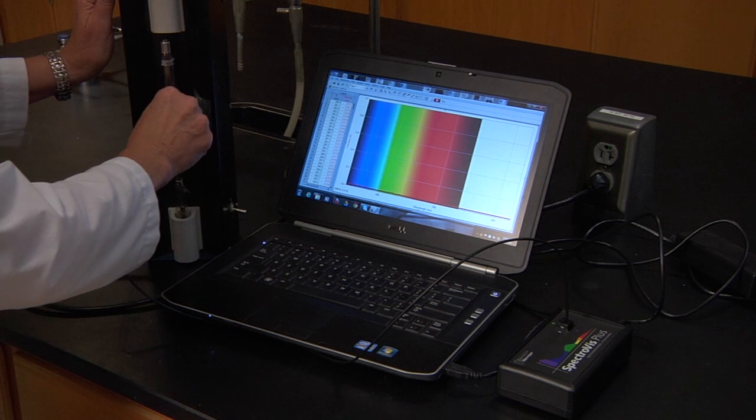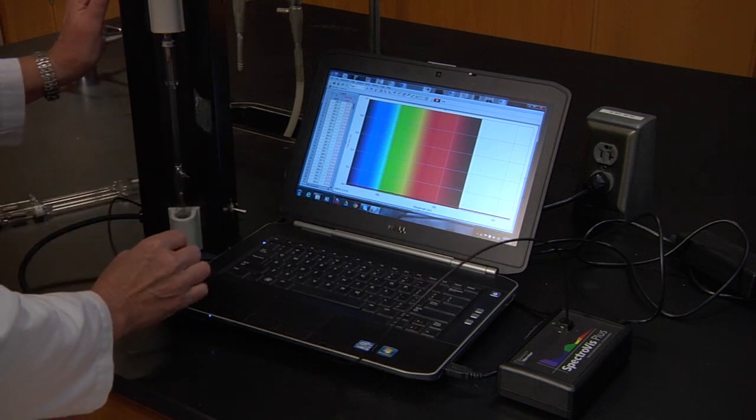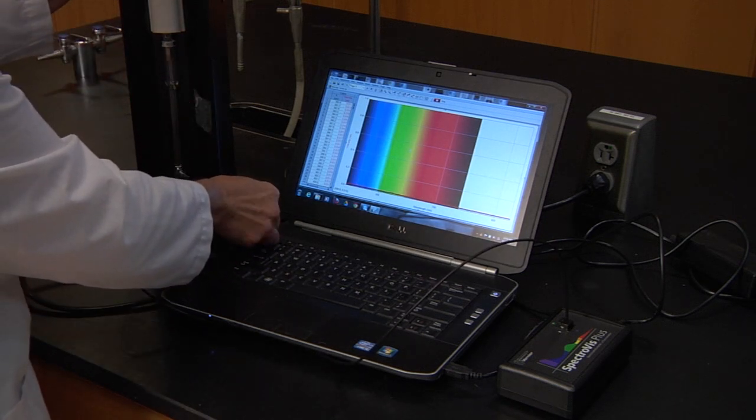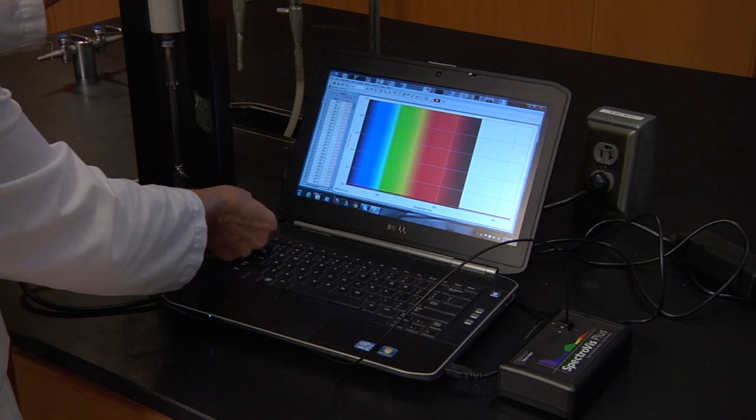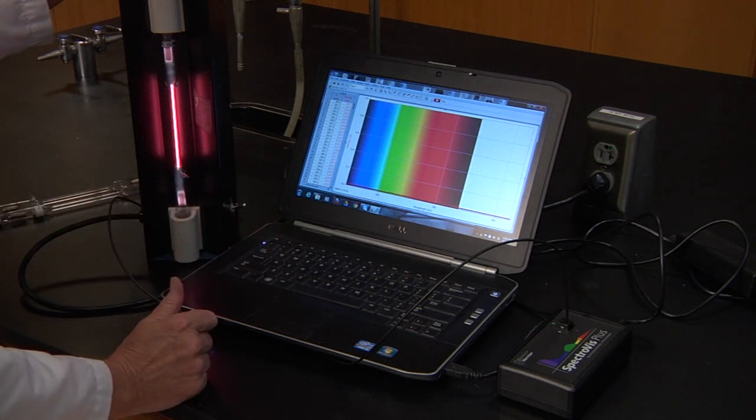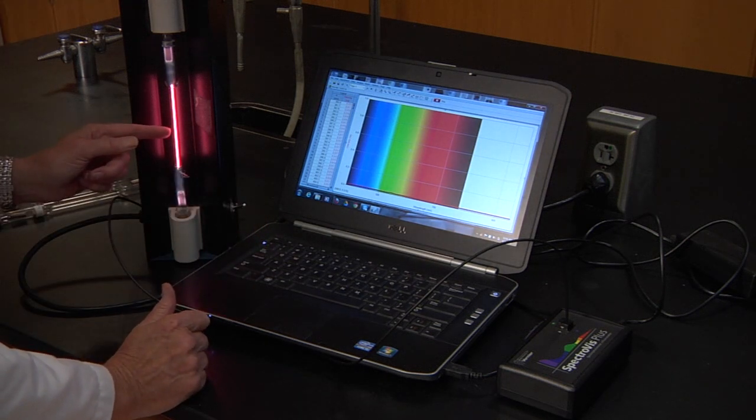Now we're going to use helium and look at the wavelengths that are emitted by excited atoms of helium. Visually, you can see there is a different color.